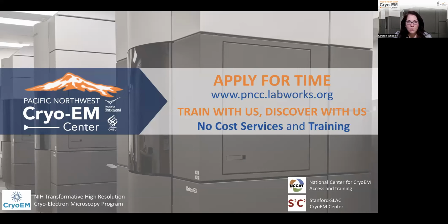The second proposal type is general access, which awards up to 480 hours of microscope time a year for 2 years. This time can be used for screening or data collection. Approved general access proposals are also eligible for our training workshops, which cover topics from sample preparation through to data processing.